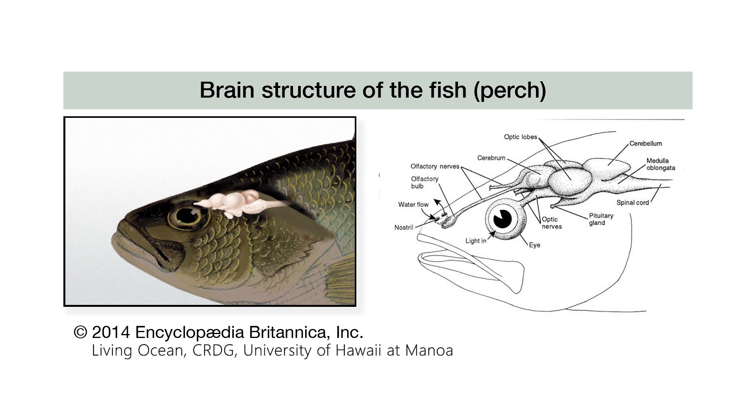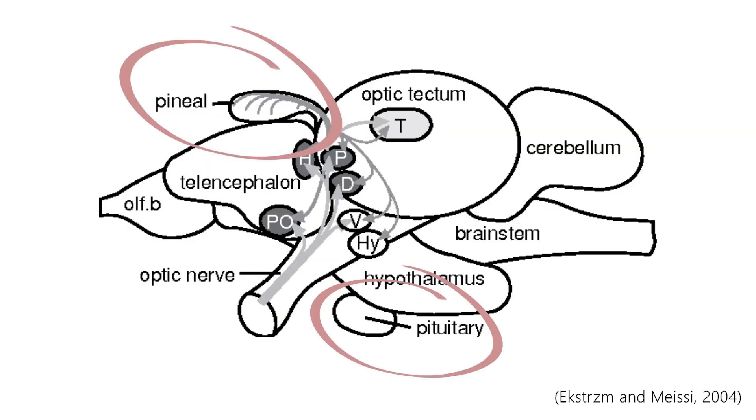The brain is composed of major regions. As we proceed with the dissection, you can see these regions as swellings. The major regions obvious in fish brain include the cerebrum, the optic lobe, and cerebellum. There are also smaller outgrowths, such as the pineal and the pituitary. The pineal can be difficult to locate and can easily be destroyed on dissection, while the pituitary is relatively easy to find.